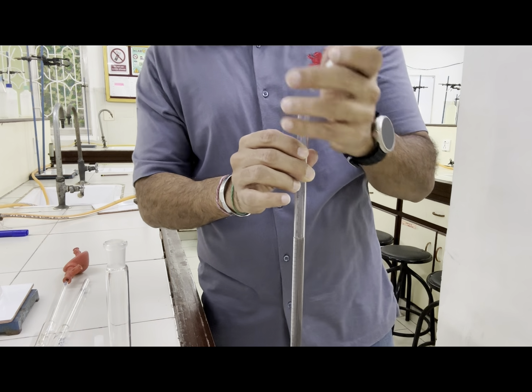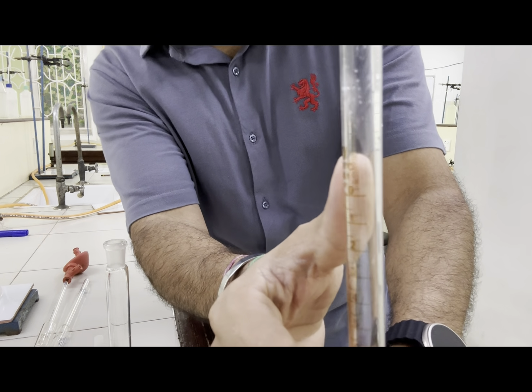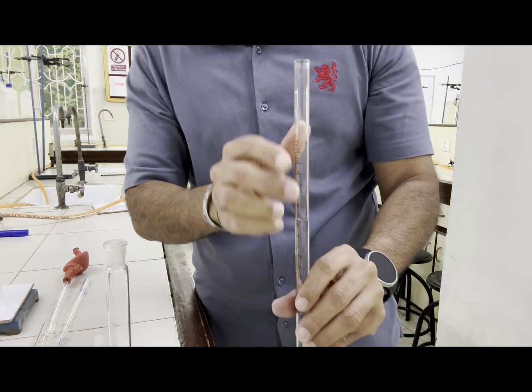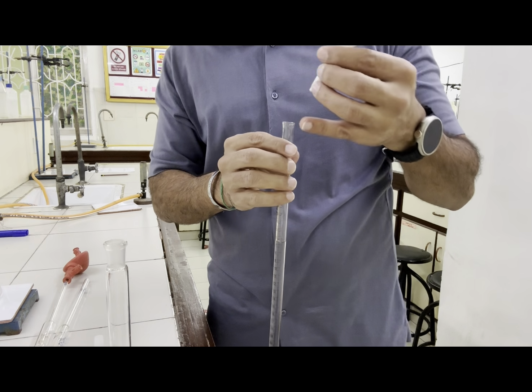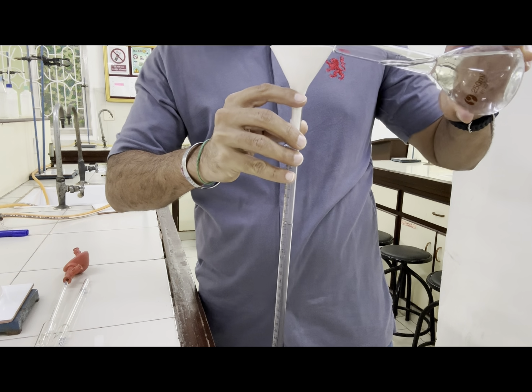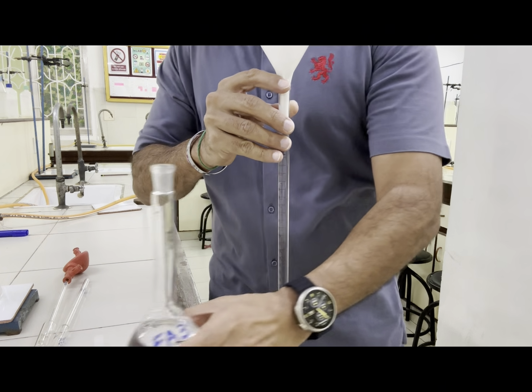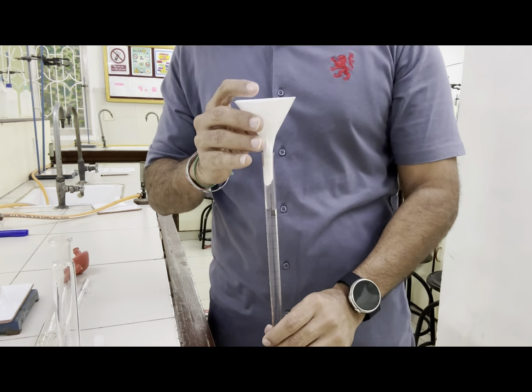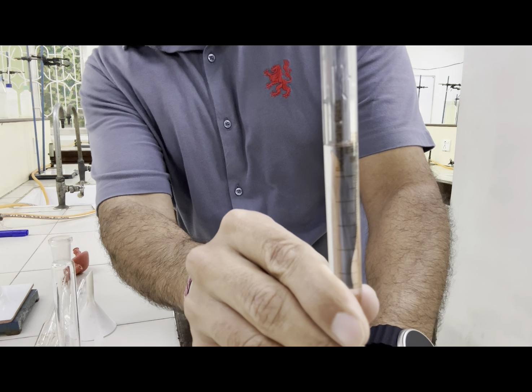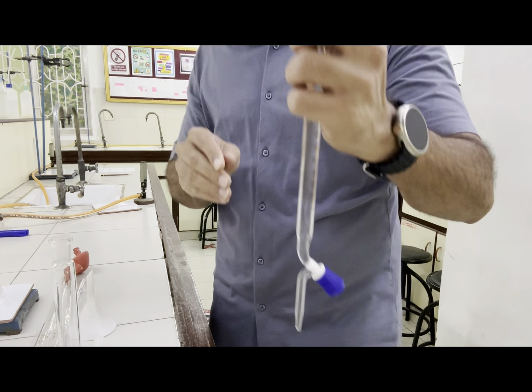Now let's make the mark up till the 0. So here is our 0 mark. We need to fill here up till 0. So let me continue adding the solution up till 0 mark. Now, when the solution goes up more than 0, here you can see it's more than 0. So what we need to do is we need to remove.